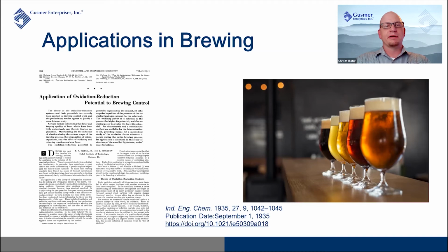Earlier, when we discussed the varying industries that ORP is used in, we didn't really mention brewing, but it is an important note that the discussion to use ORP in brewing dates back well into the 30s. Here's a paper from the Siebel Institute that was published in the Industrial and Engineering Chemistry Journal back in the 1930s. What they were looking at is how to use ORP for brewing control. This idea and this concept was spot on. However, the technology just didn't exist for them to do this effectively.